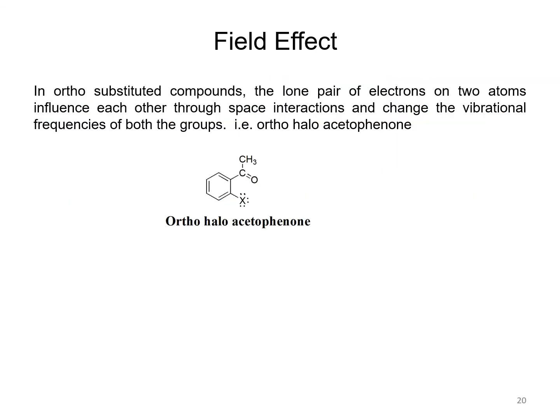Now the field effect. Here, in the ortho substituted compound, the lone pairs of electrons on two atoms influence each other through space interaction and change the vibrational frequency of both groups. That is ortho-haloacetophenone, and this one.